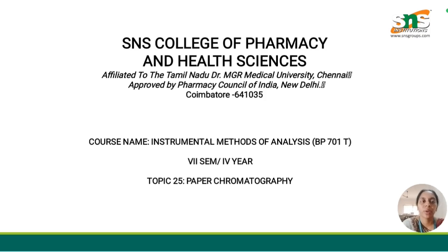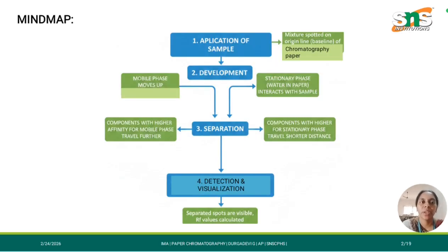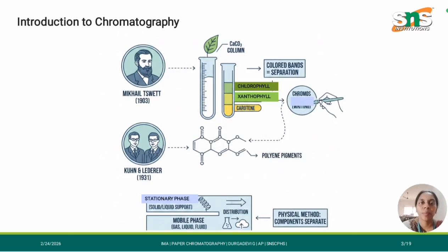In this lecture video, I am going to discuss paper chromatography. This video will include the application of sample, development techniques, separation, detection and visualization. And the separated spots will be calculated for their RF values.